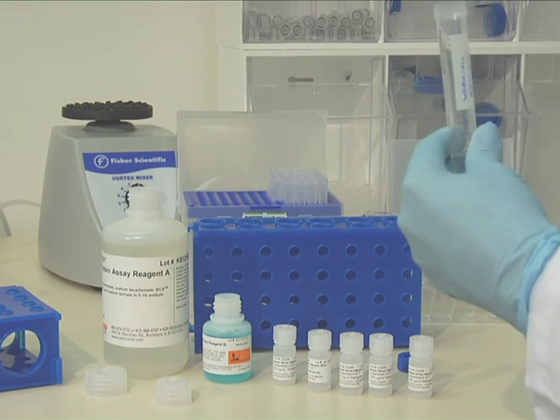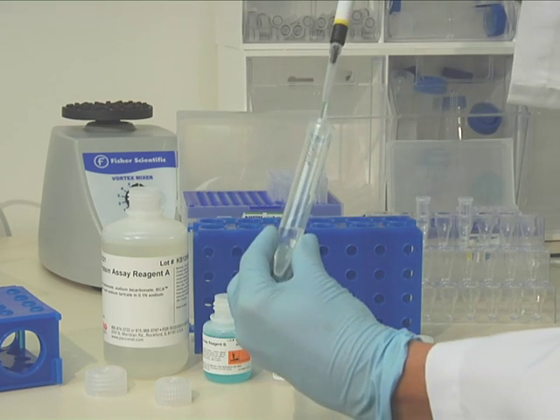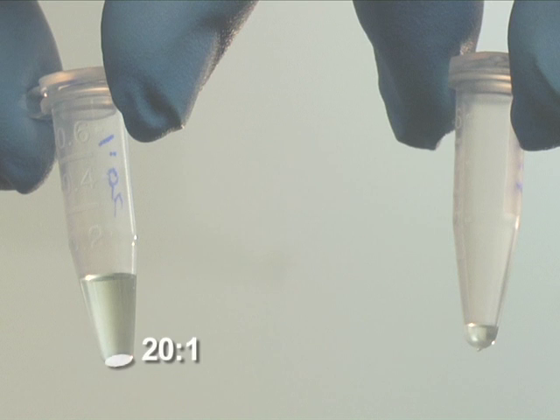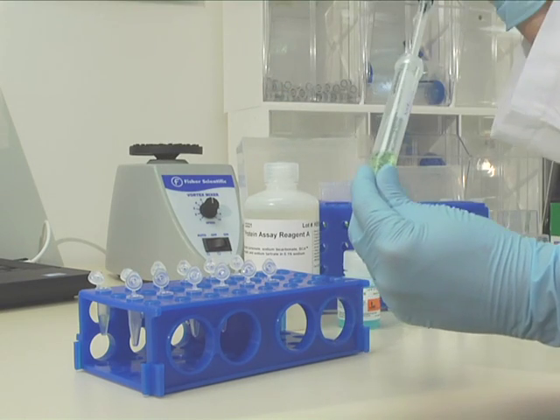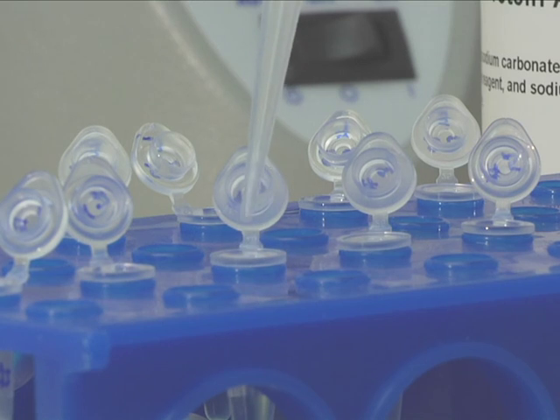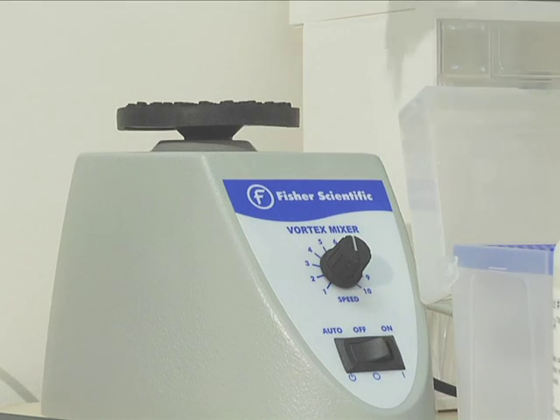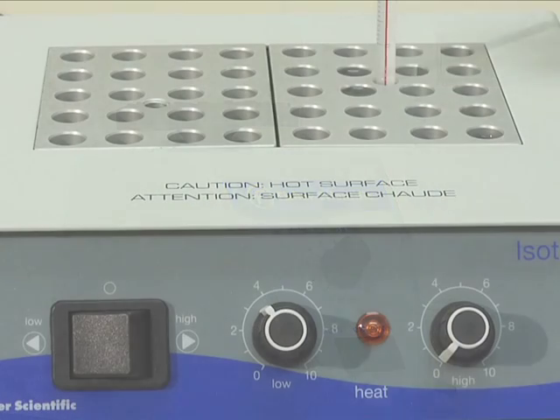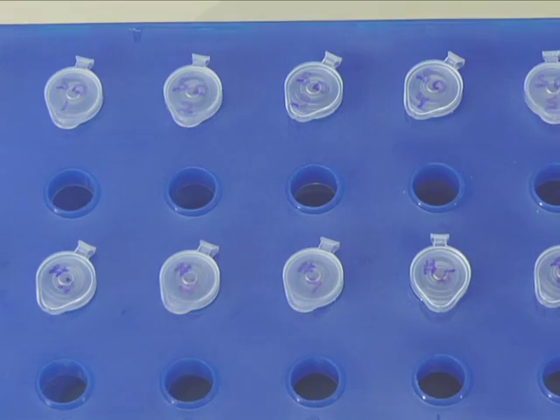In this example, we will prepare 3 mL of working reagent to cover the reference, 5 standards, and 6 samples. The regular BCA assay covers a wider dynamic range and uses a 20 to 1 reagent to protein ratio, whereas the micro-BCA assay is more sensitive and has a narrower dynamic range, using a 1 to 1 reagent to protein ratio. Because we are performing the regular BCA assay, we will prepare a 20 to 1 ratio of working reagent to sample. Add 190 µL of working reagent to each tube, then add 10 µL of standard or sample, mix well by gentle vortexing, and incubate at 37°C for 30 minutes. After incubation, allow the reactions to equilibrate to room temperature for about 10 minutes.